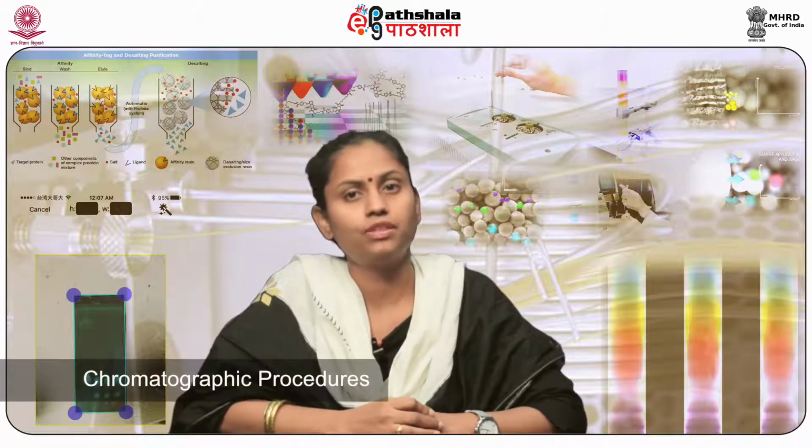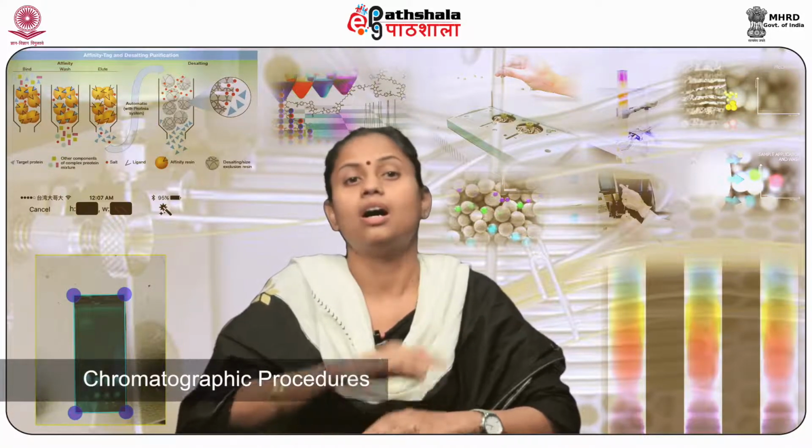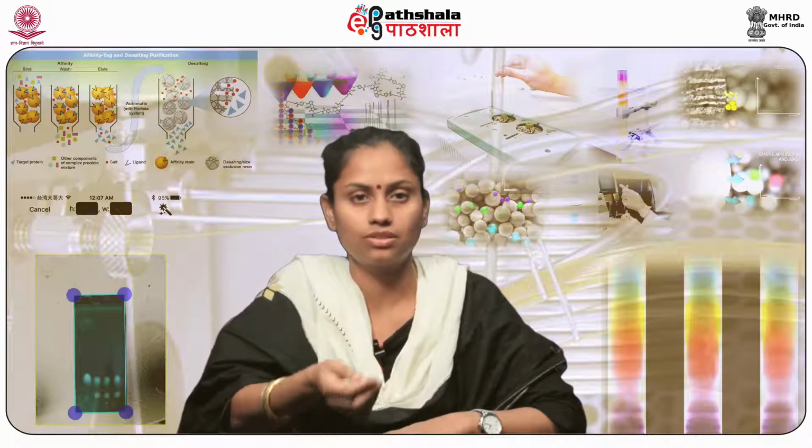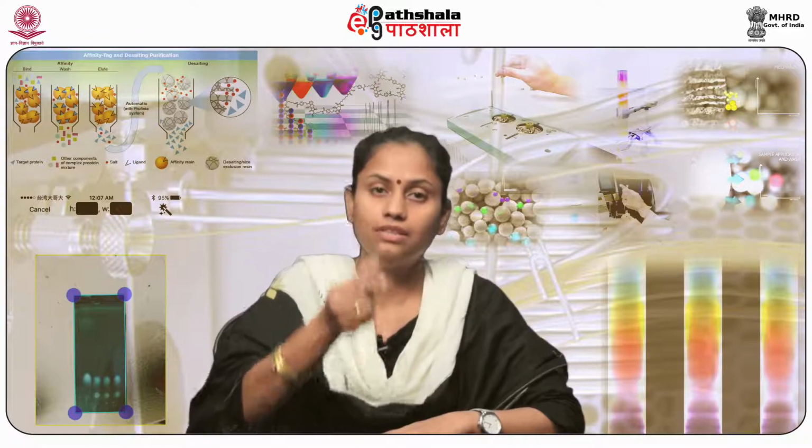During chromatographic procedures, usually a combination or a mixture of solvents is introduced into the system as the mobile phase. Now, according to the binding affinity of the analyte in the mobile phase, it elutes from the column. Eluate or effluent is another term which is used in chromatography. It is actually the mobile phase that leaves the column after the procedure.